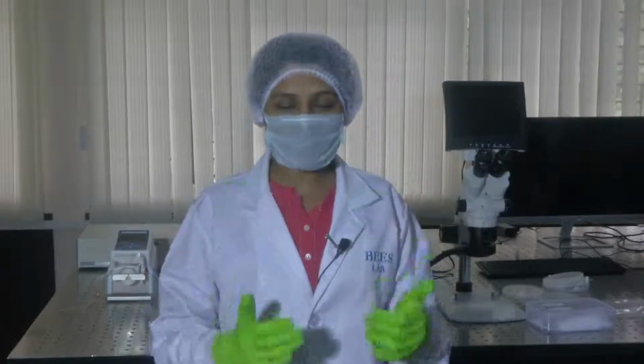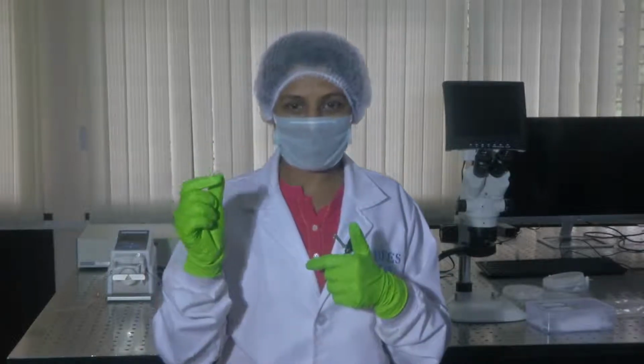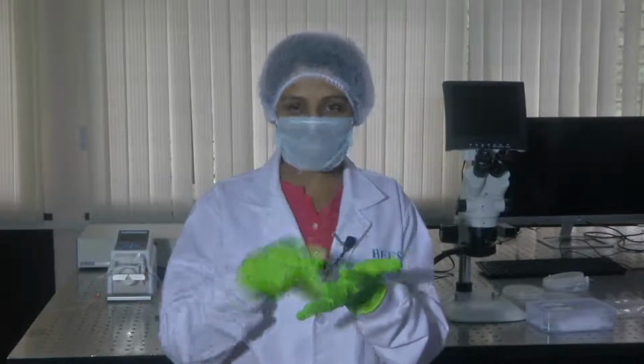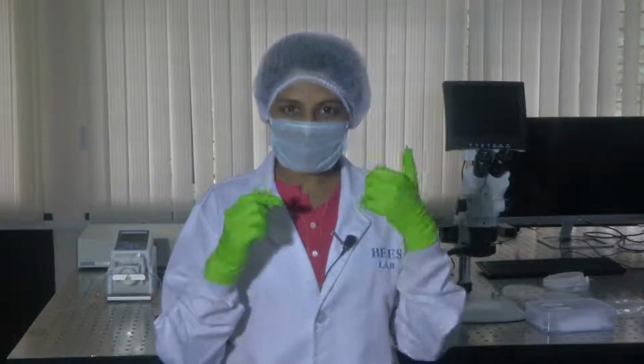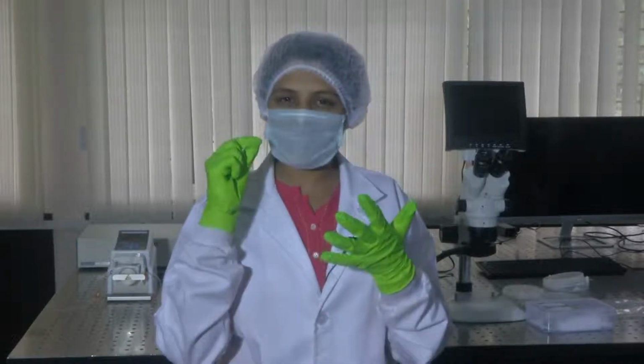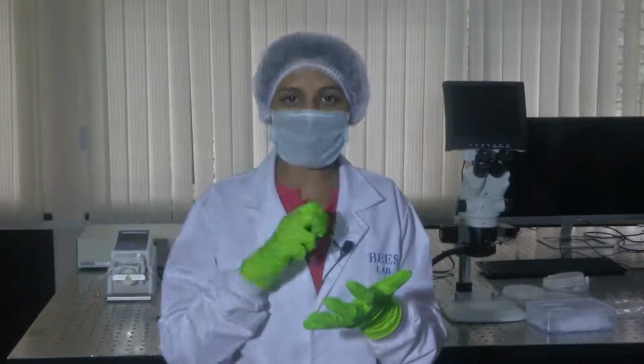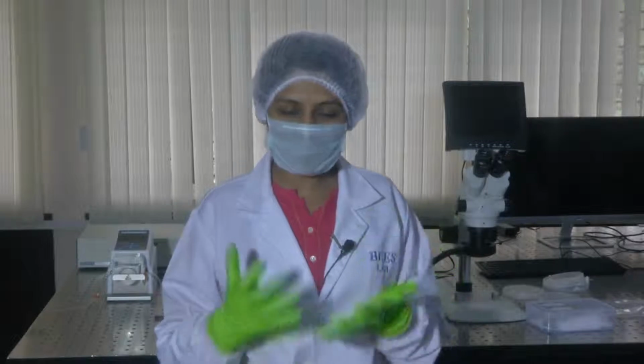So, now that you know it is 1 milliliter, we are talking in terms of microliters of fluid going into these channels. Now you get the point. There is a very minimal amount of fluid flowing through these channels, and how you can precisely control the flow is very critical while we do analysis and work with these kinds of biochips.